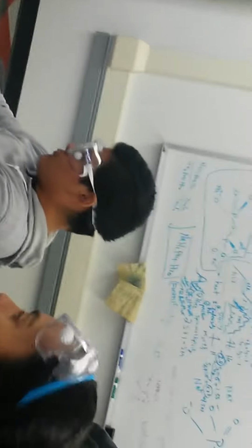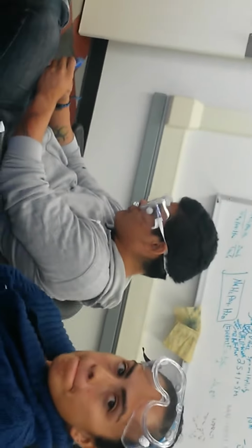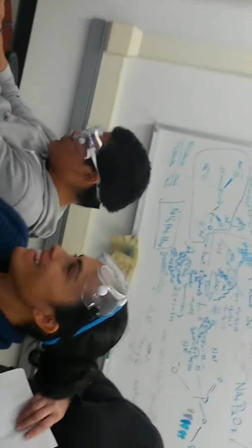And then the next person, whenever they want to come on, will do exactly the same thing. They will load up their method and the sequence, which we'll tell them where we'll be at. They do the sequencing, and then they just take their sample. Here, we're doing it all in one swoop. So when you guys are ready to come back in, whatever time it is, like for Rebecca, you come back tomorrow or on Tuesday, whatever, to pick up the data. You're done.